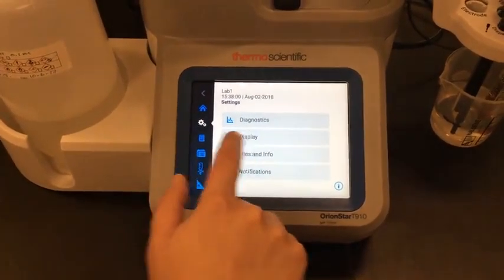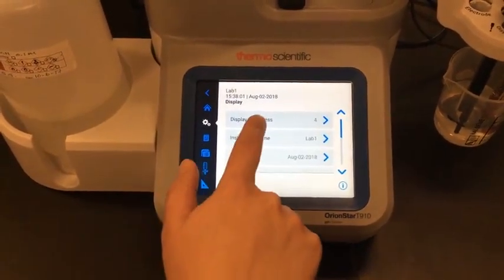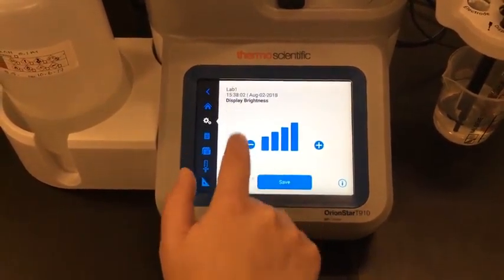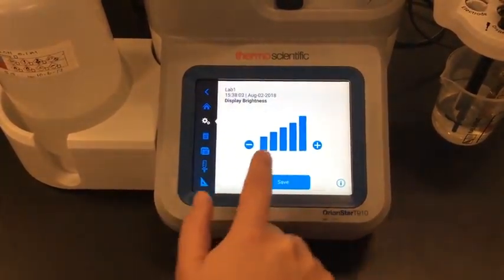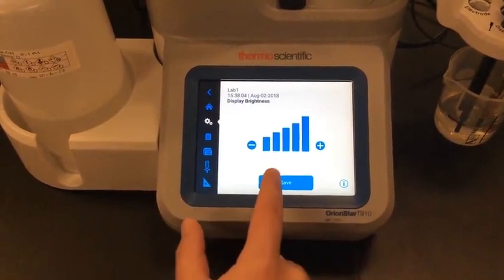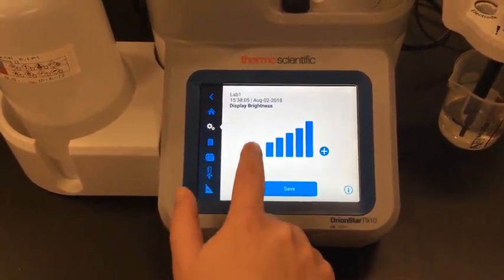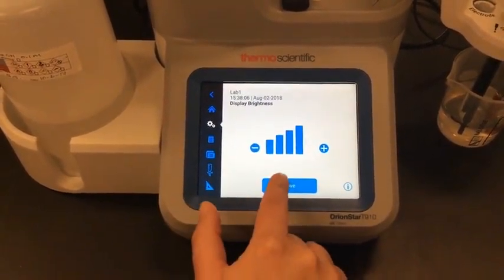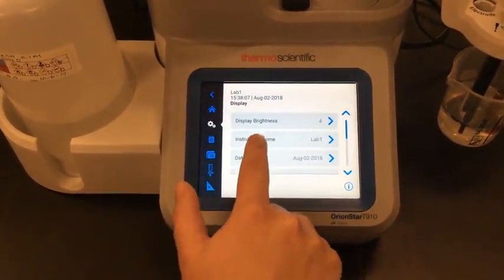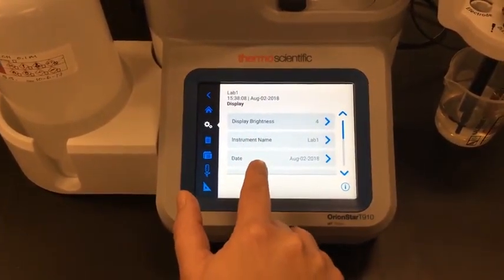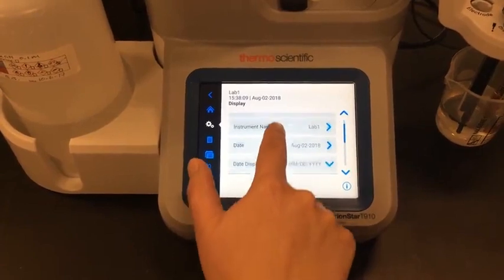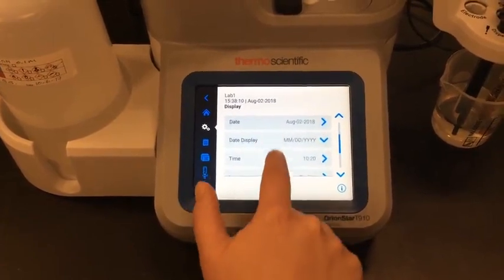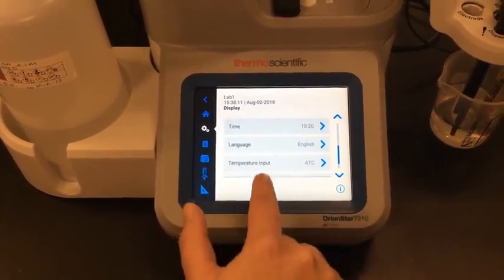I can also go into the display and adjust the brightness in case I feel that my display isn't bright enough. I can change my instrument name, set the date and time, and also change the language settings.